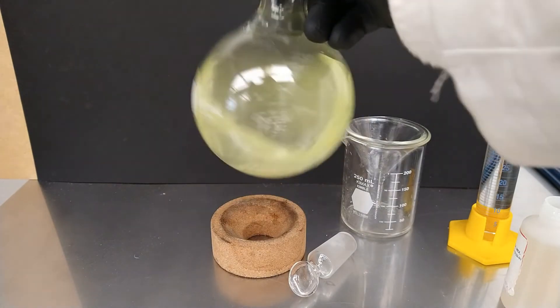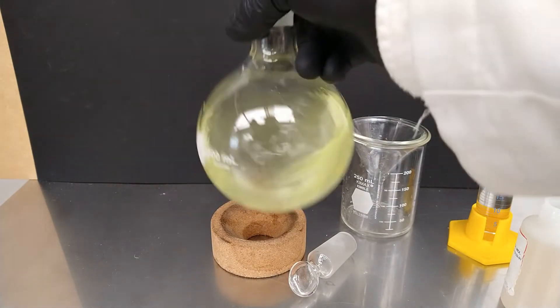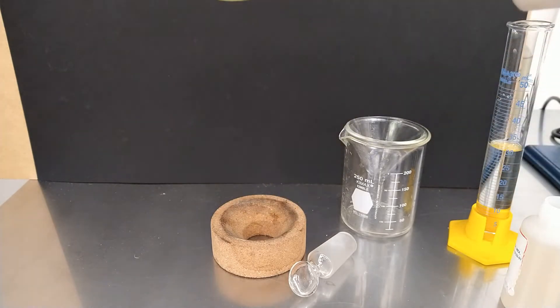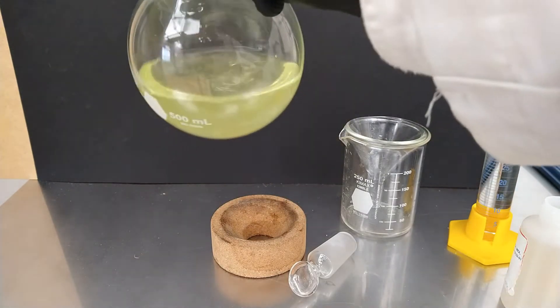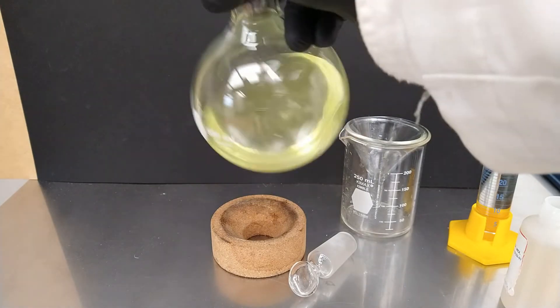Then we swirl the flask a couple times to try to dissolve all the sodium tungstate. We can see the yellow formation of tungstic acid.